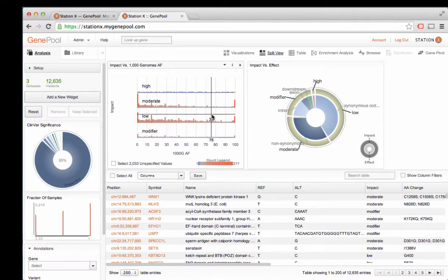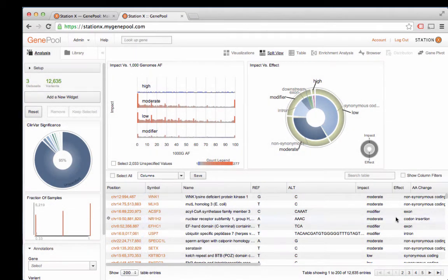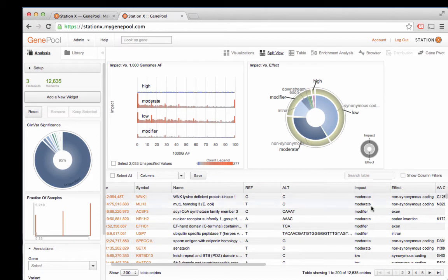these 3 samples. For example, if I wanted to look for non-synonymous mutations, or those kinds of mutations that are likely to have a biochemical impact, say frame shift mutations or splice site effectors, I can open up this column which shows you the effect as well as the impact as computed by SnpEff.